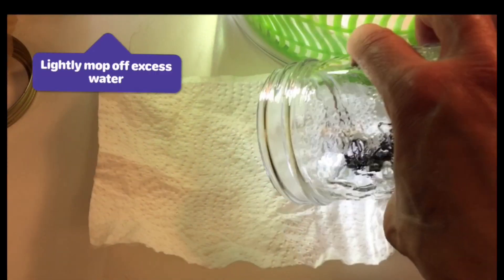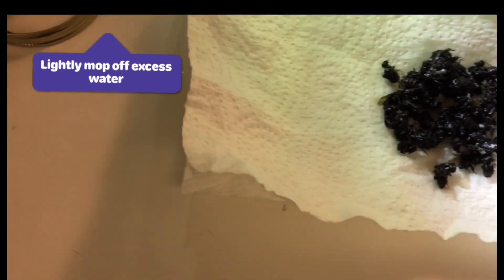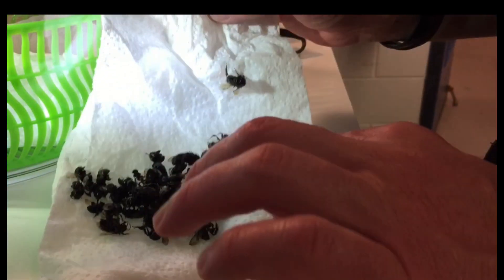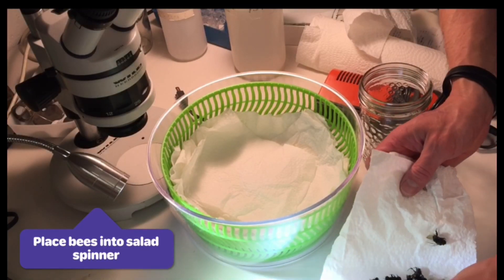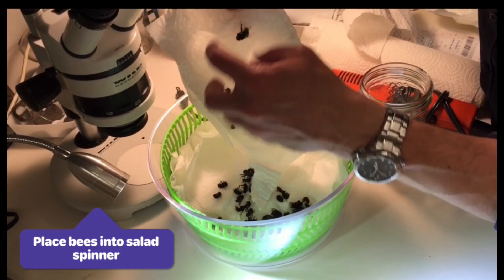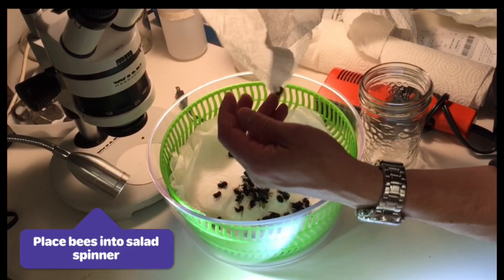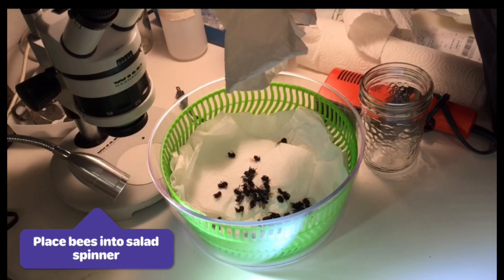First of all, I'm going to dump the bees out on some paper towel to get the large amount of water off of them — just dump them all out there and pat them off very lightly. So I'm just gently patting the bees dry first of all. Next, we're going to put the bees into the salad spinner. I've already got paper towel inside — I like this soft three-ply paper towel; it's quite absorbent and gentle on the bees. Bumble bees are very robust insects — they don't break easily, and even the wings are very, very strong.